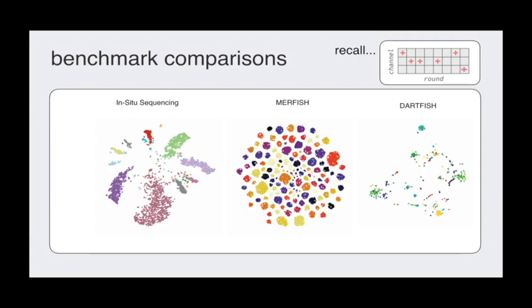When you reduce the dimensionality, that sort of pops out at you. And so for Dartfish, for example, this could be a visual diagnostic to go back and ask: is it something with the encoding? Is it something with the way that the data were processed? It's unclear, but the nice thing is we can do these comparative analyses and ask questions about how to benchmark the signal-to-noise ratios and the decoding capacities and so on and so forth.